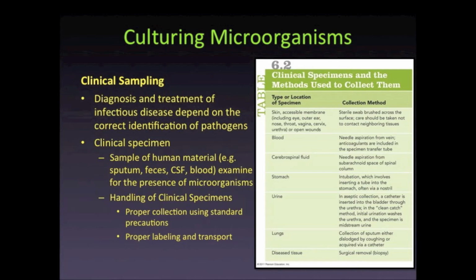And the specimen should be properly labeled and promptly delivered to the lab. The specimens are placed in media known as transport media that has salts and buffers necessary to maintain them for a short period and maintain their relative ratios. Samples that are not promptly delivered place the microorganism to be identified at risk of dying. As seen in the table, clinical specimens can be taken from a number of locations on the human body using a variety of methods.